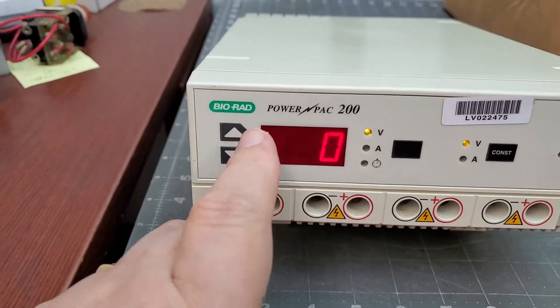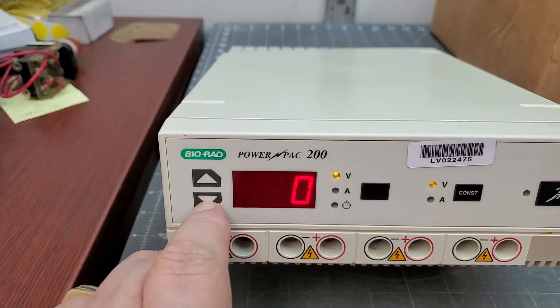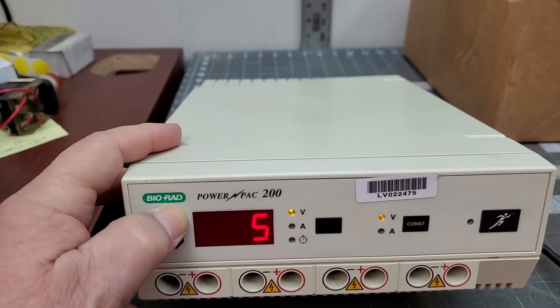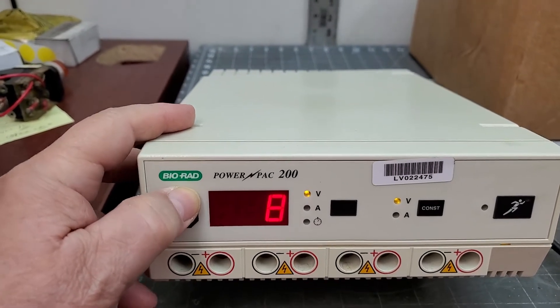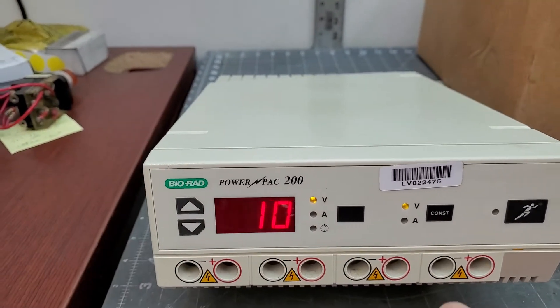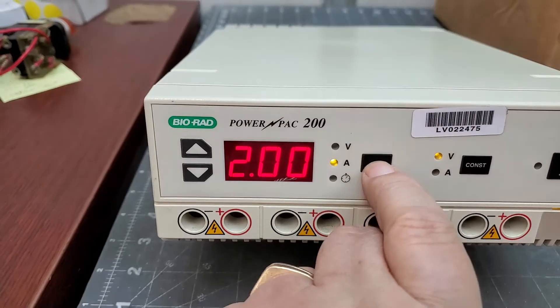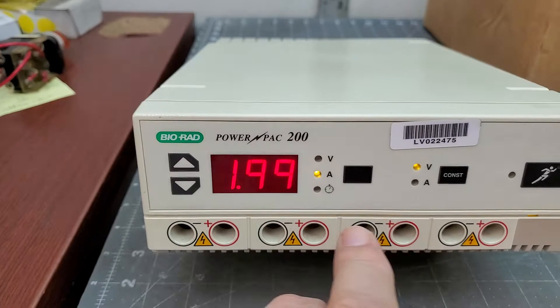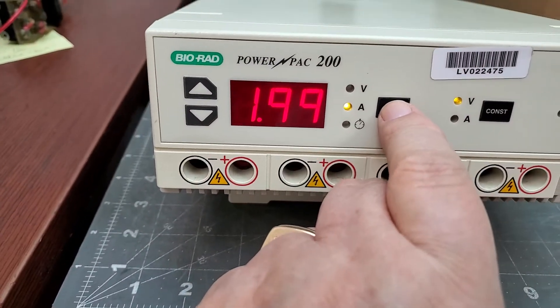All the buttons seem to do something. That goes up and down, whatever that is. Then you've got this thing, and you can make this go whatever — amps, I guess.